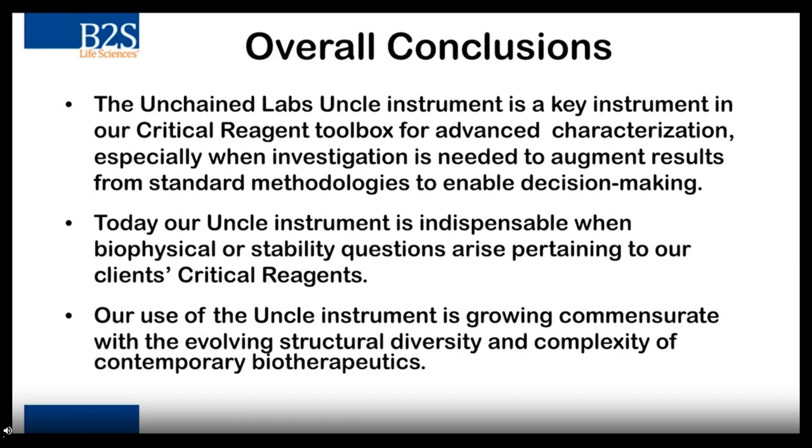So that leads us into our overall conclusions, which as you've seen over the course of the last two case studies, the Uncle instrument has on many occasions proved to be a key instrument in our critical reagent characterization toolbox for our advanced characterization activities. And this especially comes into play when such investigations are needed to augment or sometimes even replace more traditional characterization methods.